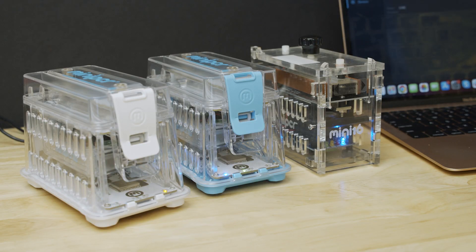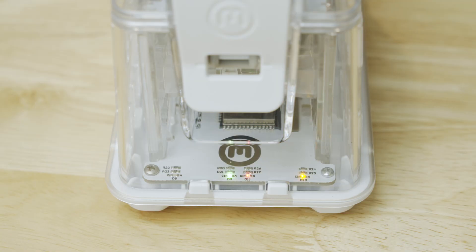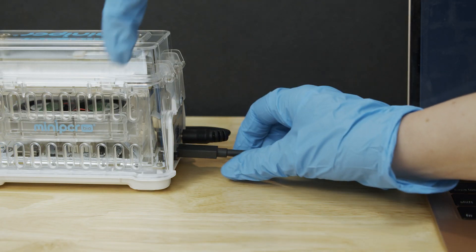The Mini-PCR app allows several machines to be programmed simultaneously by the same device, and machines can be pre-programmed in advance and will run even when disconnected.